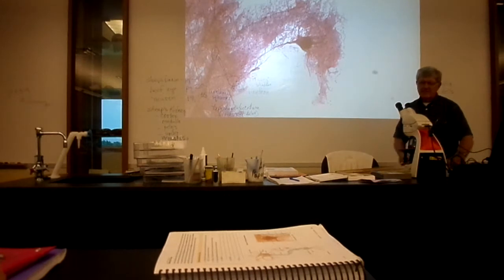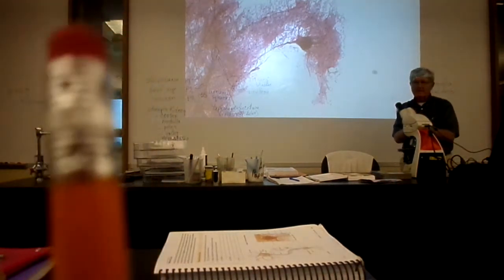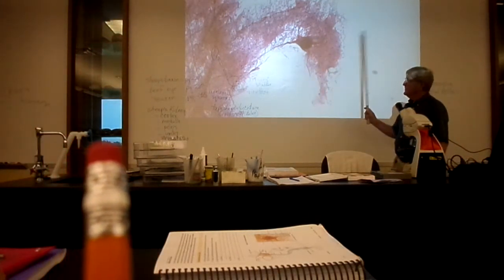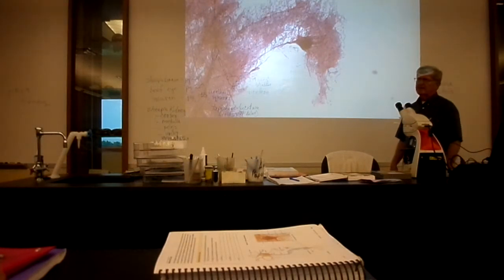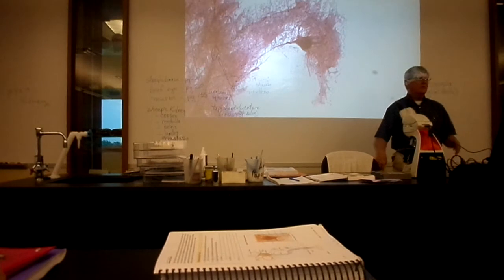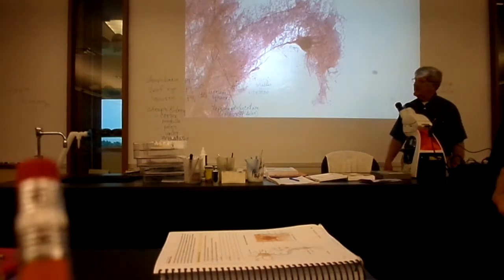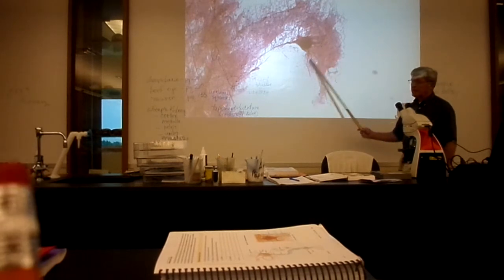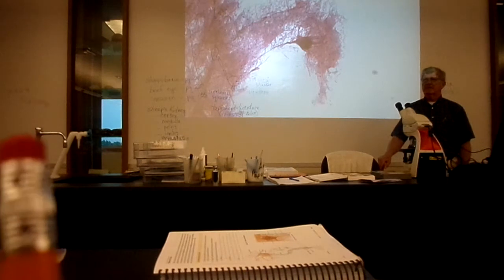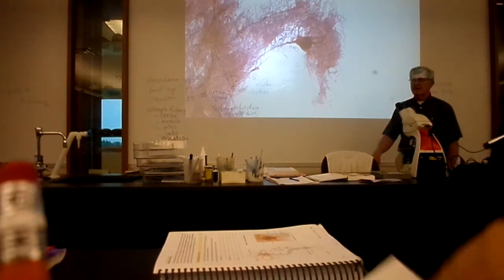I like to think of them as pointing in opposite directions relative to that cell body. So this one's pointing east and these are pointing west, or whatever you want to call it. Now the single long one is called what? Look at your diagram. It's called an axon. And the multiple, shorter ones are called dendrites. Be sure that you can distinguish those on a neuron.